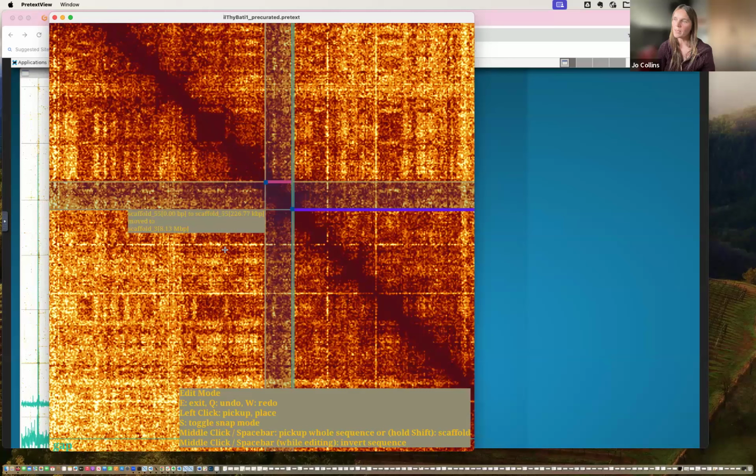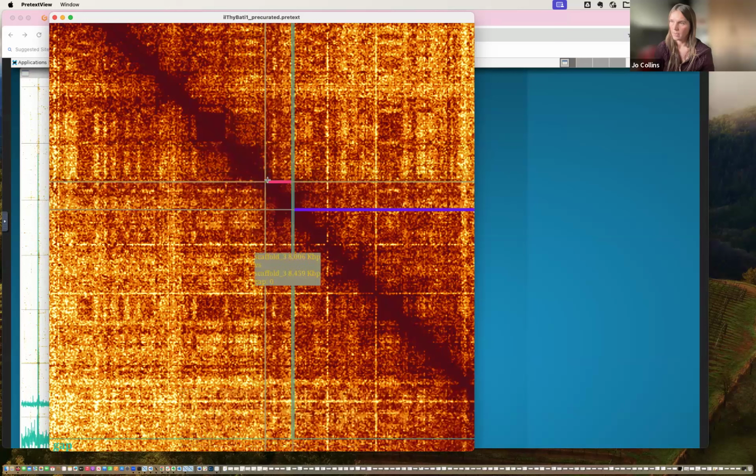So once we've got it in position where the signal looks correct, in this case we can see clearly that this is the right way up, because we're looking at this signal here where it's a nice strong signal all the way through the join, and this signal here where it's also a nice strong signal.